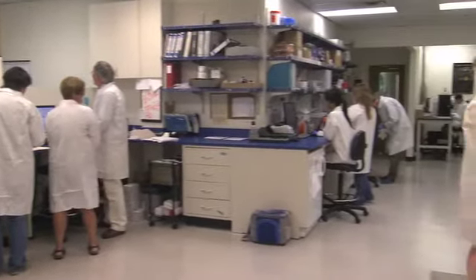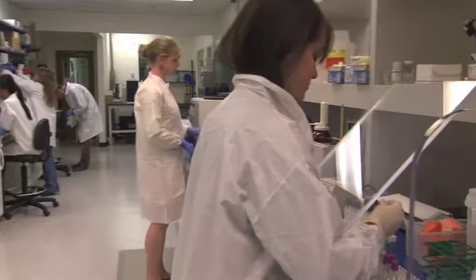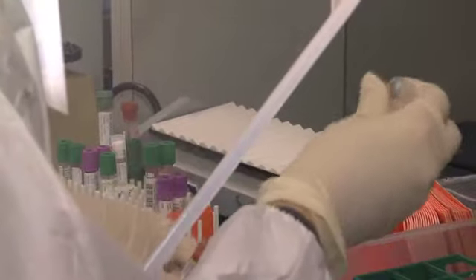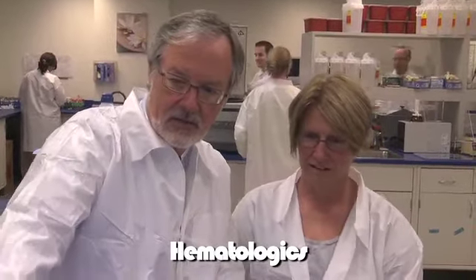Hematopathology has become more and more complex, requiring multiple technologies including flow cytometry, molecular genetics, and cytogenetics combined with morphology to make a complete diagnosis. Often the treating clinician may not know what tests to order, so they order many things in order to cover all their bases. Dr. Loken is the president and laboratory director of Hematologics, a hematopathology reference laboratory located in Seattle.